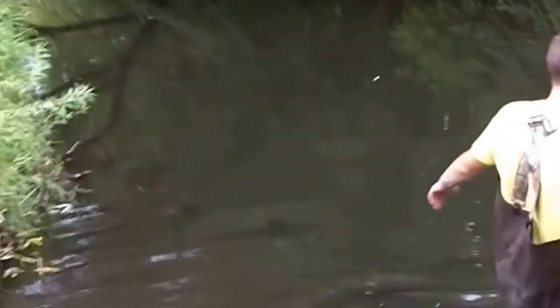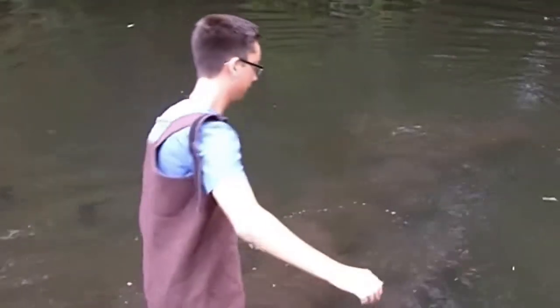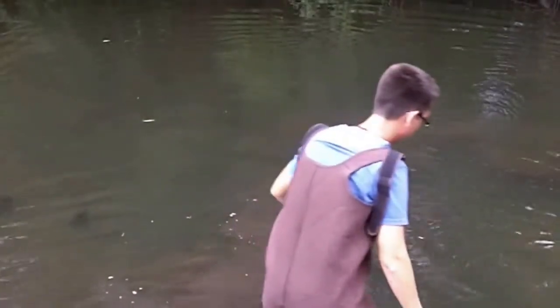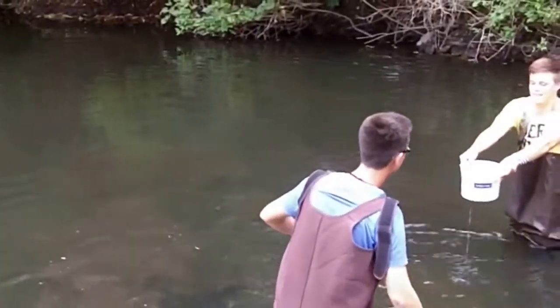One of the first things we're going to do is the bucket brigade, because we need the water for transparency tests. It's really important that when you walk into the water, you lift your feet up — you can already see all the sediments stirred up. I'm going to walk in.